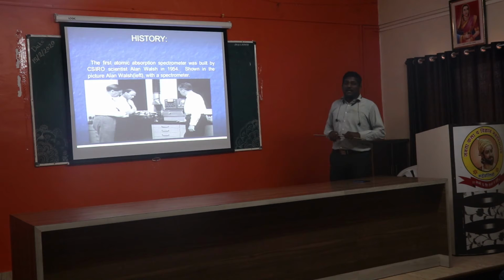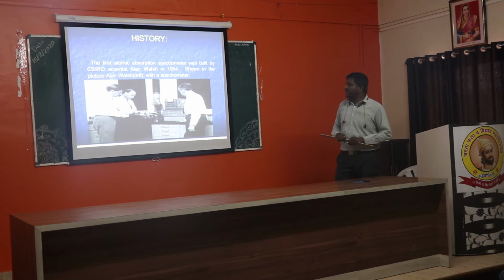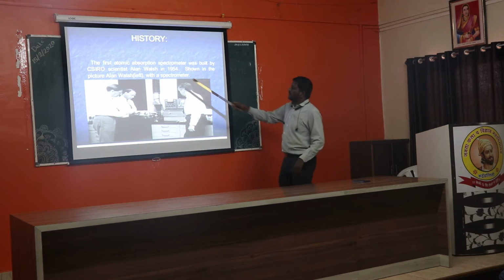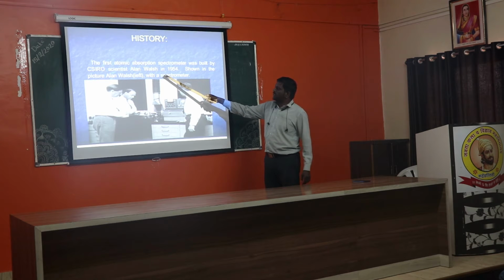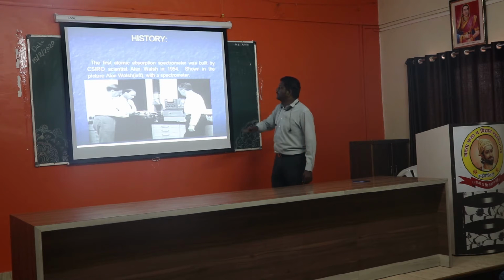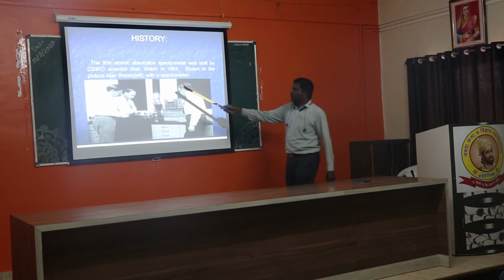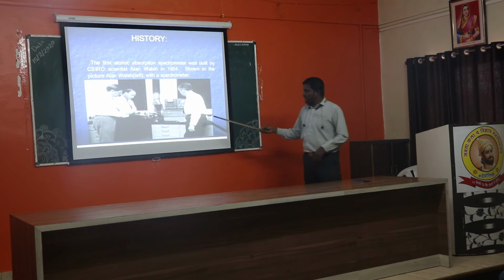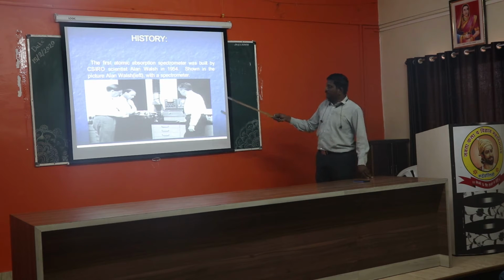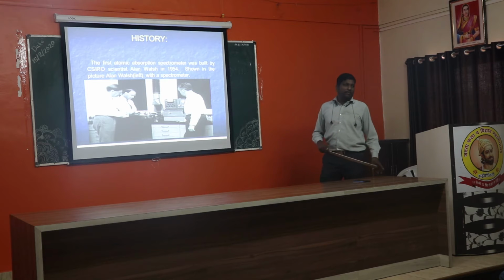Next one. Now what is the history of this AAS technology? The first atomic absorption spectrometer was built by CSIRO scientist Alan Walsh in 1954. Shown in the figure, Alan Walsh is on the left hand side with the spectrophotometer. If you see the diagram, this is the first introduction of this technique in 1954.